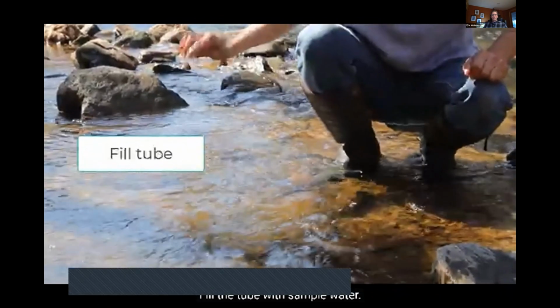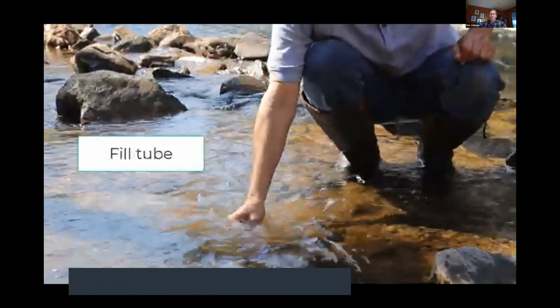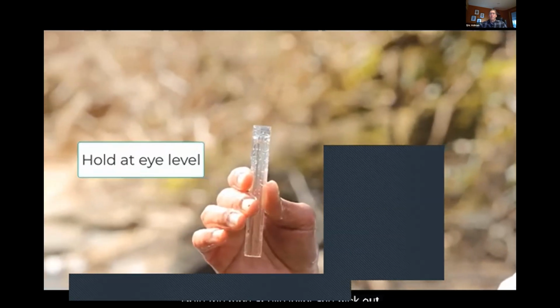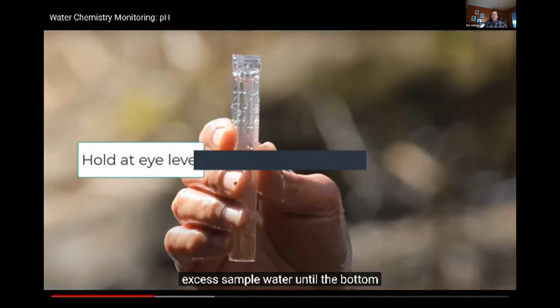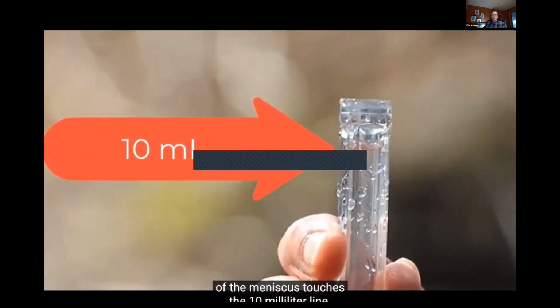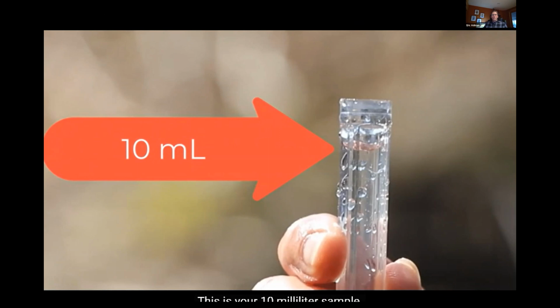Fill the tube with sample water. Hold the tube at eye level and flick out excess sample water until the bottom of the meniscus touches the 10 milliliter line. This is your 10 milliliter sample.